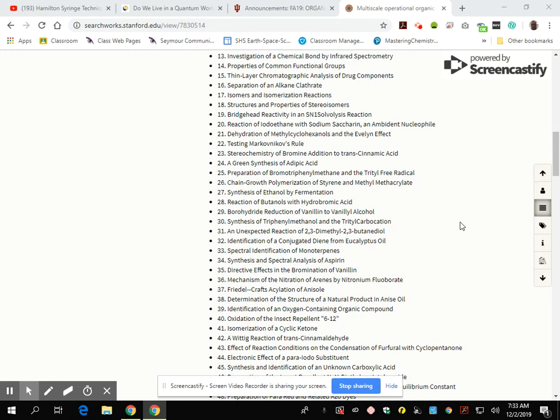dilute our sample. It has to be diluted extremely. As you can see, 1/1,000,000th of a liter. They're all liquids. They all dissolve in ethyl alcohol. And get its spectrum, compare the spectrum to the calculated lambda max. And I don't have the questions right now in front of me, so I can't tell you which questions to do, but that's going to be the entire experiment.